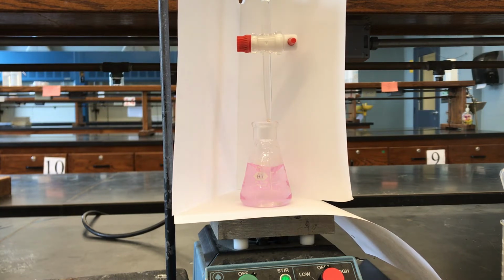So what was going on is initially when it was clear in color, we still had excess acid. We still had acetic acid in there. So the sodium hydroxide was dripping in, reacting with the acetic acid. It would neutralize completely, and you still had acetic acid left over. When we just added that last drop of sodium hydroxide, when it went pink, all of a sudden we had basic conditions. So we had added just 1 drop more sodium hydroxide than we had acetic acid to react with it. So this gives us the end point of the reaction, the point where we've completely neutralized all of the acetic acid with the sodium hydroxide.